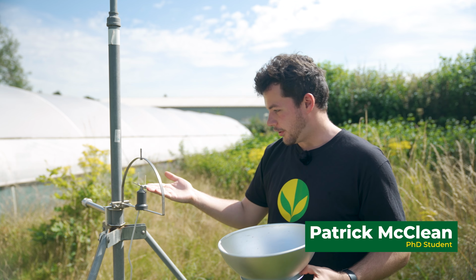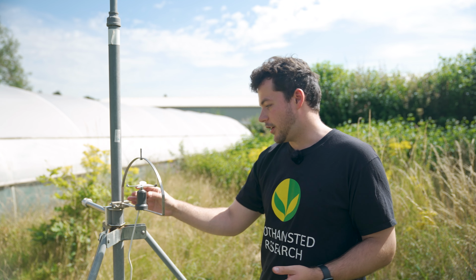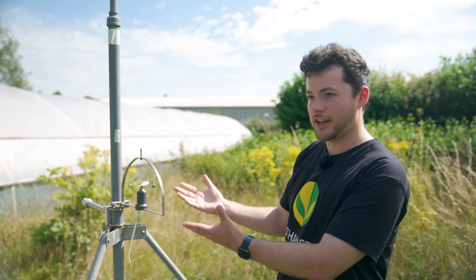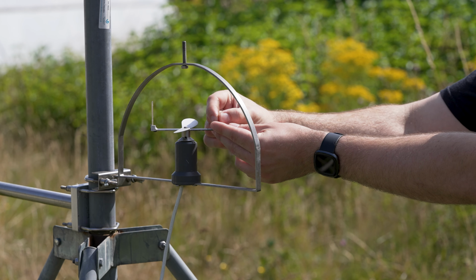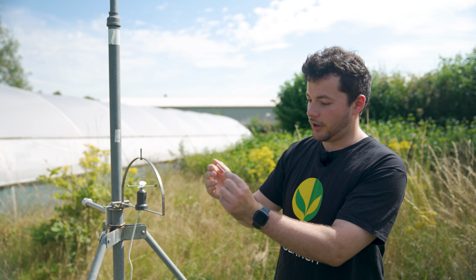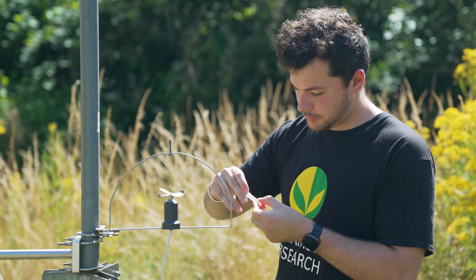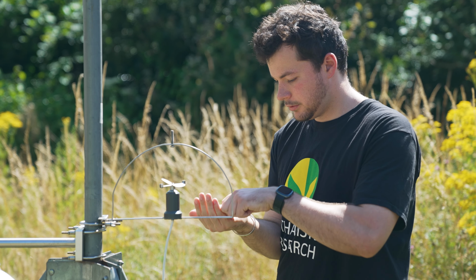So this is a rain shield that just pops off here and reveals the spore trap itself. Just pop that there. And what happens here is these two rods are spun round at very high speeds, which sucks in any air below. It sucks about 100 litres of air a minute, and then these two rods just pop off like this. And what we have here is a polythene rod that's covered in a thin layer of Vaseline, which will impact any sort of airborne particle, be that a spore, some pollen, or even small insects. And we can take these back to the lab and do subsequent analyses.